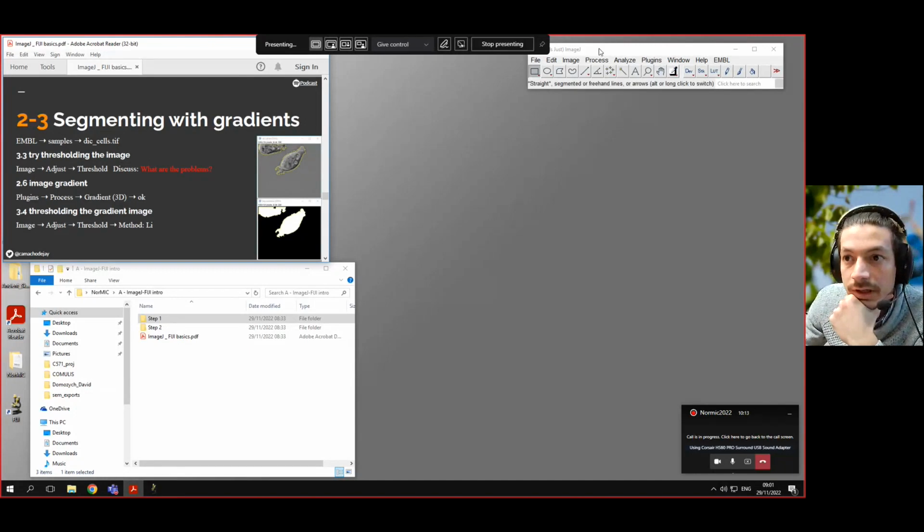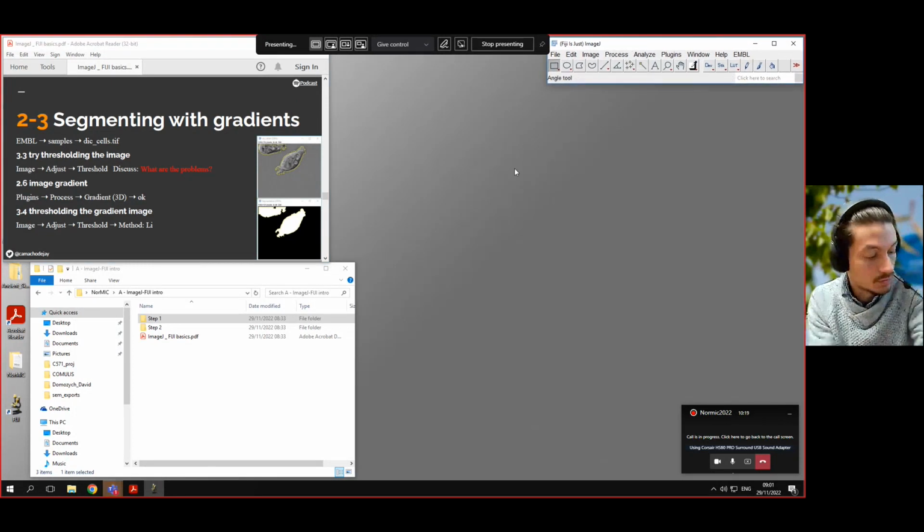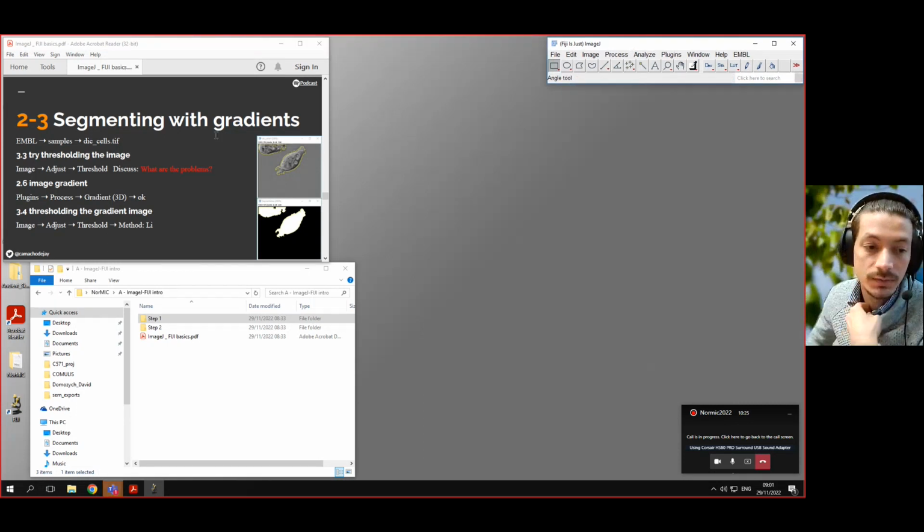Hello. So the idea of this short video is because sometimes I don't have enough time to cover all of the examples that I have. So right now we're going to be covering this part of segmenting with gradients, which can be quite important with some of you, especially with people working in transmission microscopy or DIC. So you should have already installed the EMBL plugin that is described in a few slides before.